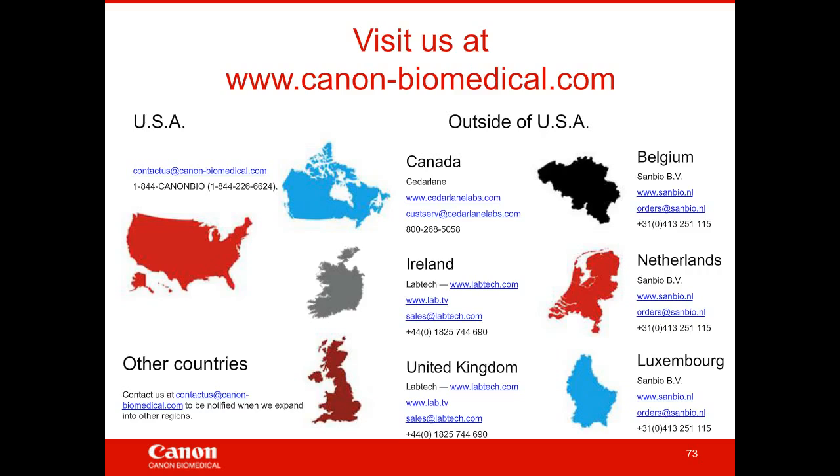Great, thank you. Thank you to our audience members. We have some great questions coming in. Our next question is two parts. What is the best sensitivity of HRM, and can I use HRM to detect somatic mutations? Yeah, that's a great question. So HRM is highly sensitive, and in most studies, sensitivity can be anywhere from 98 to 100%. So top sensitivity is around 100%. That's often in one of those unlabeled probe assays, which I showed an example of. And then you can use HRM to detect somatic mutations. There are many papers out there that use HRM to detect somatic mutations. However, all of the assays that we offer in our Novallele library at Canon BioMedical are for inherited targets.